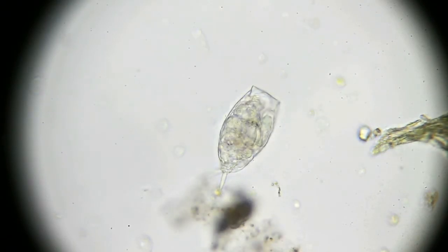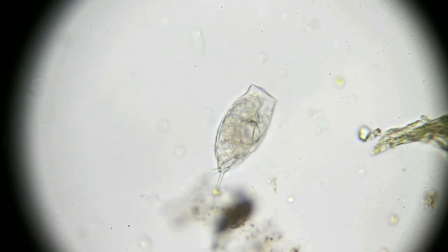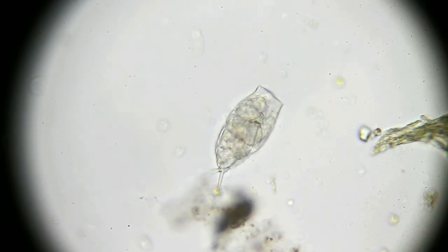This is a rotifer still in its egg sac, and it looks like it's very, very close to actually hatching. If you watch this particular clip, you can see some material come out of the egg sac in a moment. I've got quite a lot of footage of this, and I'm going to put it all together in a separate video because it's quite interesting to watch.